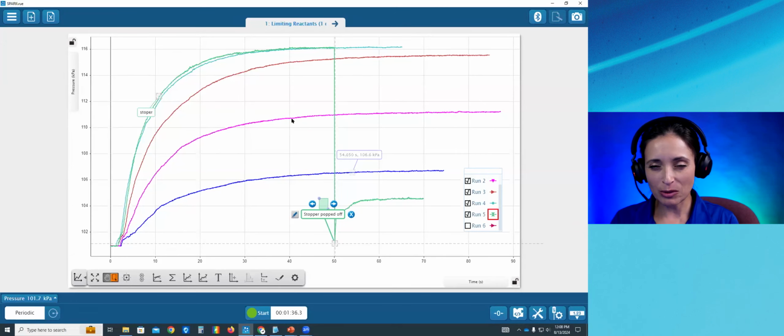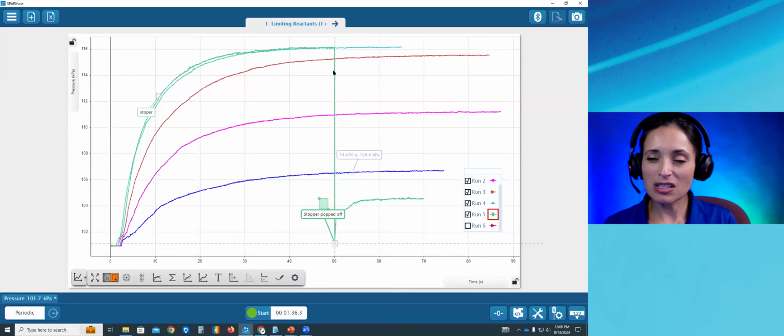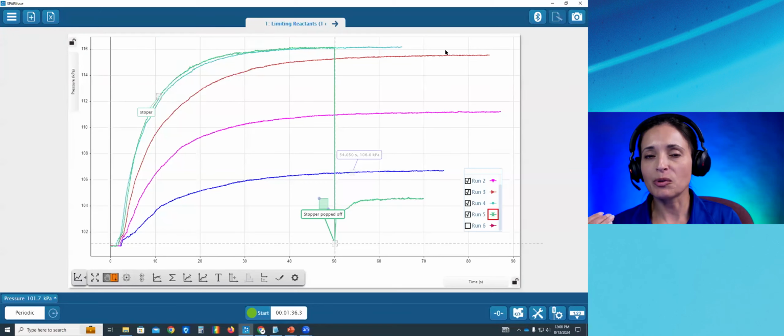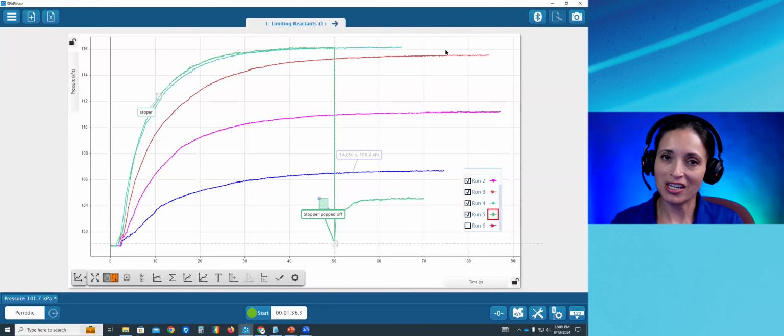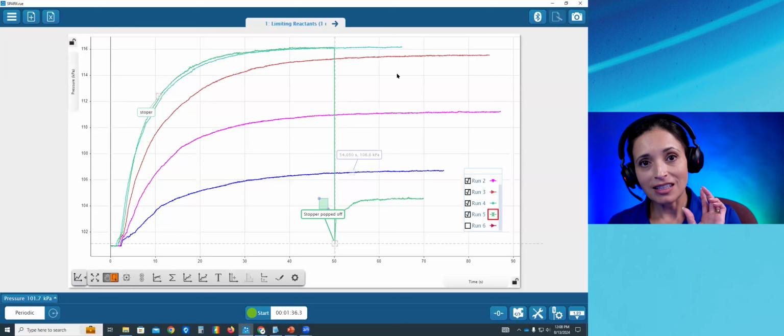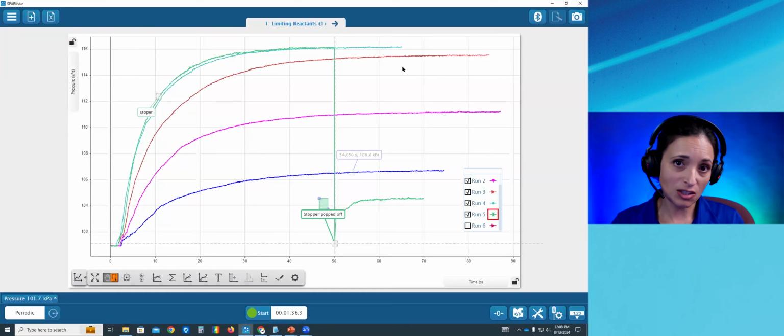So we can see visually, without doing any math, that students can qualitatively see by run 3, we've hit that ideal ratio. We keep adding more and more mass of citric acid, but we're really not getting more and more pressure change. So the product is kind of leveled off there. By run 3, we've got an ideal ratio. So you can end the lab there if you want to stick with qualitative, but you can even take it further and do the quantitative as it's written.